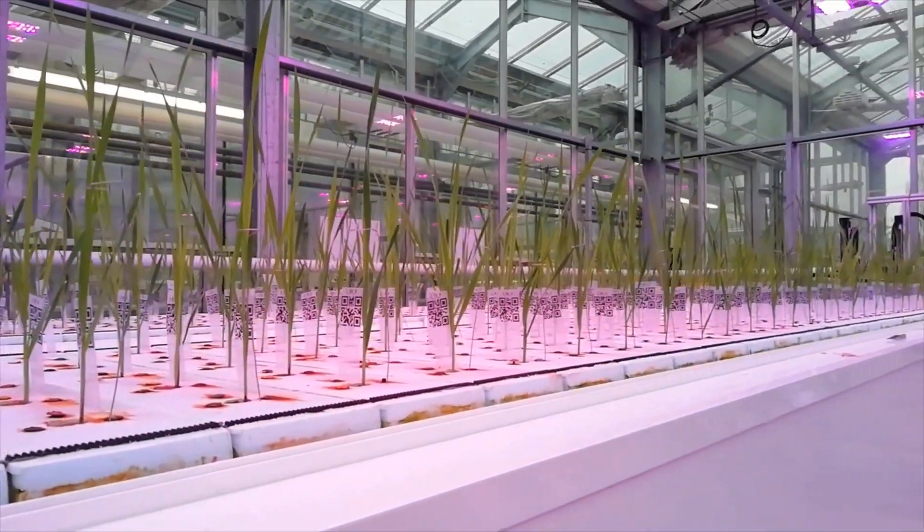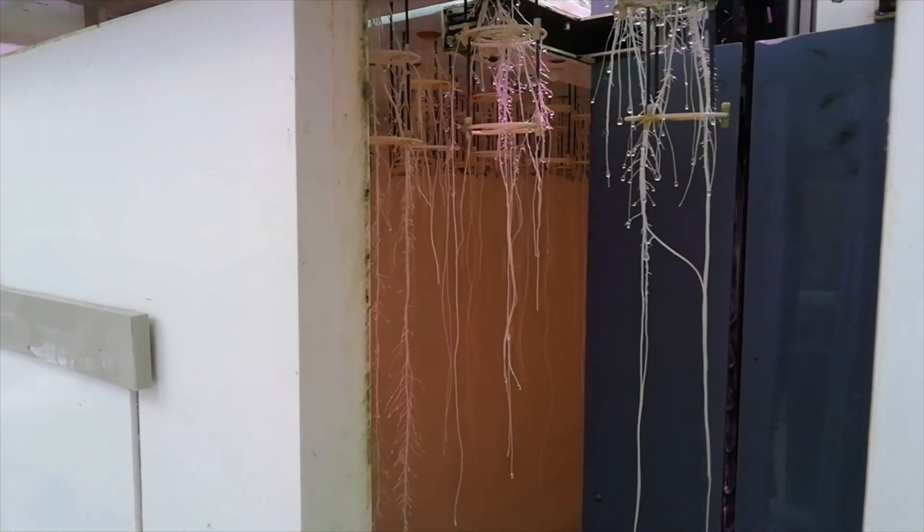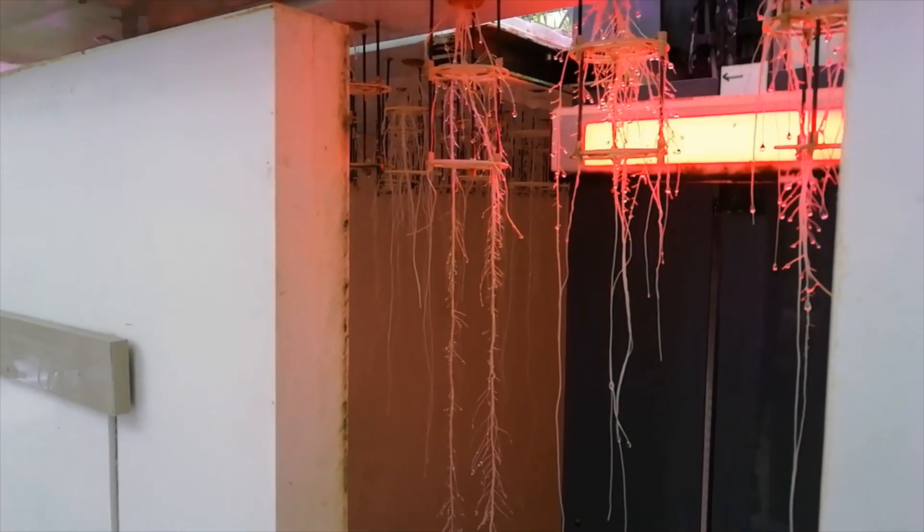Each plant was photographed every two hours for 21 days. At the end of this period, we collected the data on fresh and dry weight.